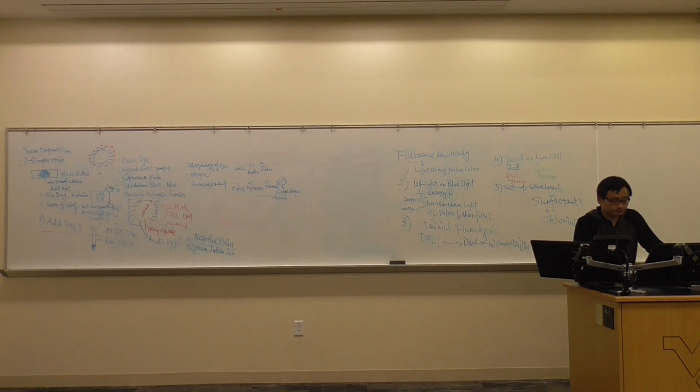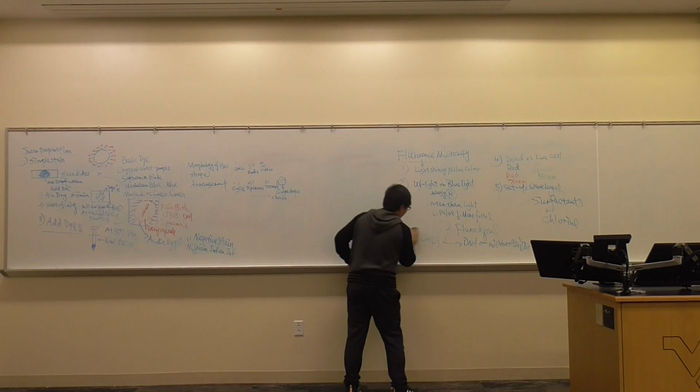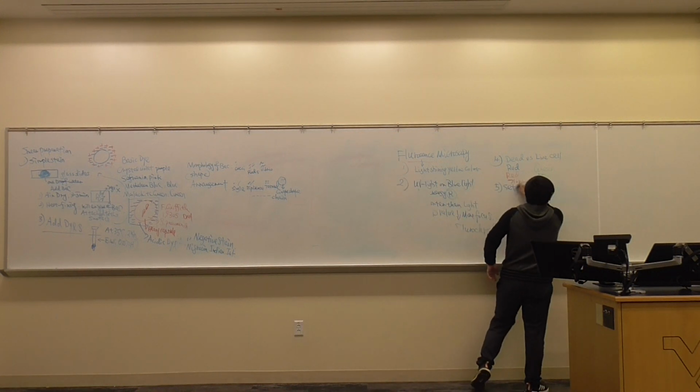So that's a negative stain. Now next, we want to spend some time to talk about the differential stains: gram stain, acid-fast stain, endospore stain, flagella stain, capsule stain. But we will spend a lot of time talking about this gram stain first. This is usually a major part of microbiology staining technology. Let's talk about the gram stain.